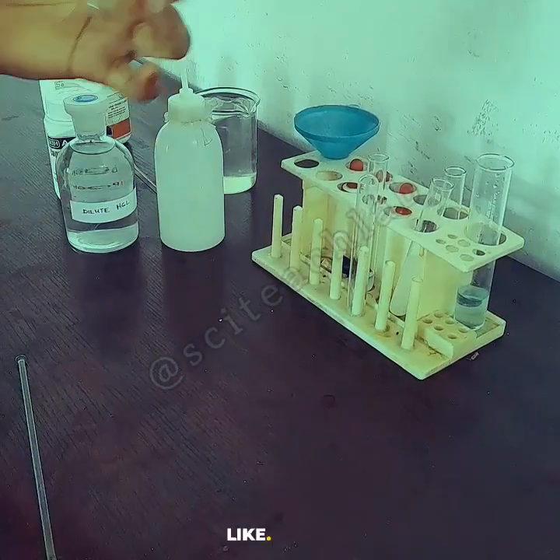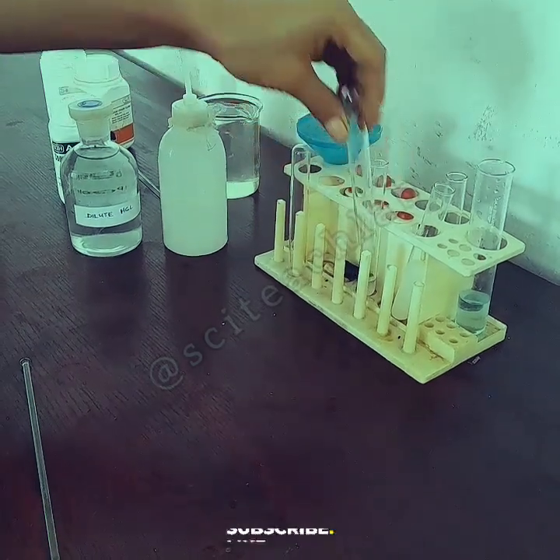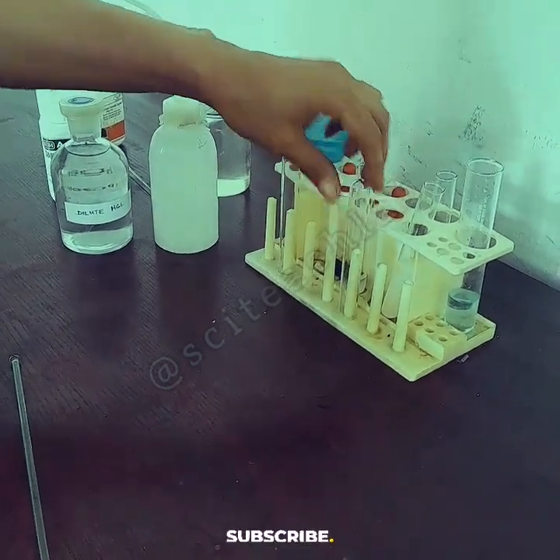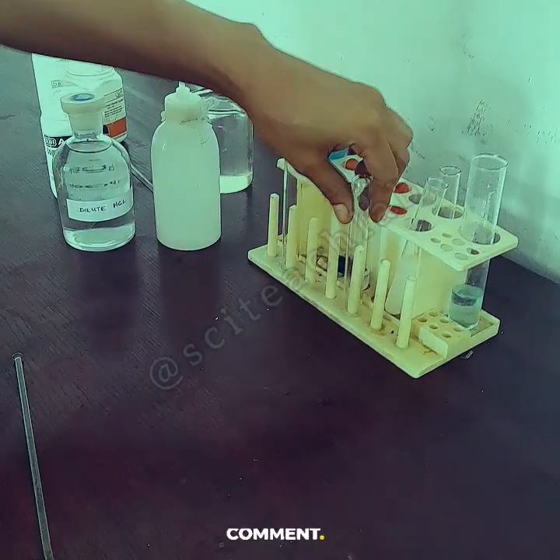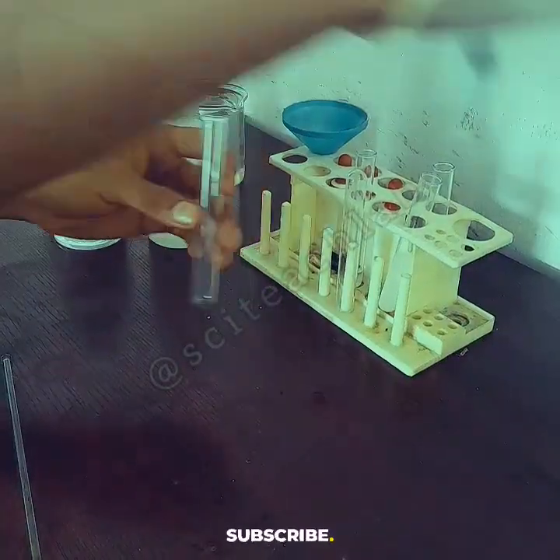This is a qualitative analysis video, and we're analyzing a mixture of glucose and copper sulfate. So we're going to carry out the process here and then see how to report it in our report form.